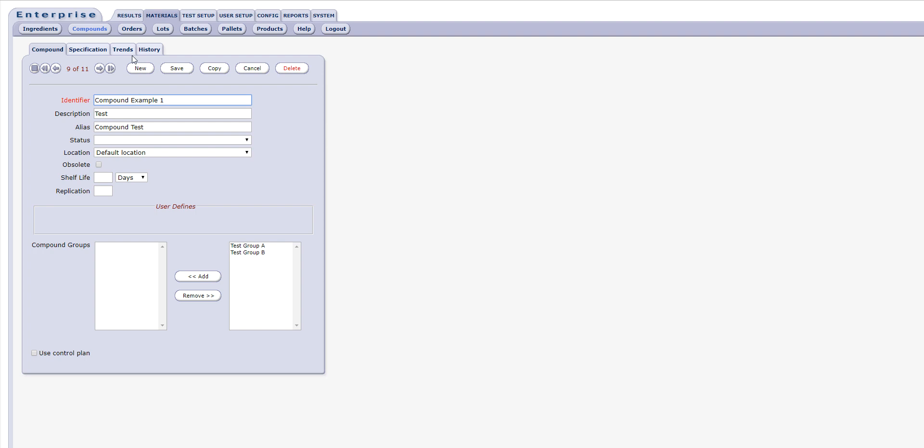The available tabs include the main compound tab, which contains the specific descriptive elements such as name, description, alias, status, and location information.